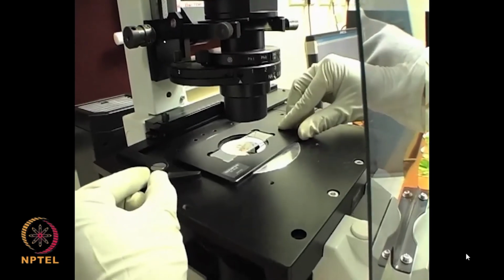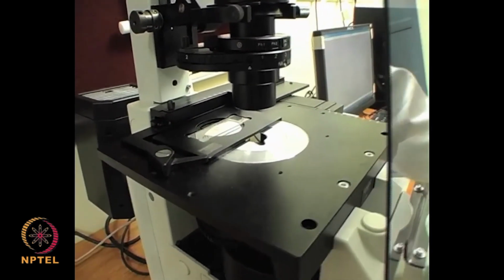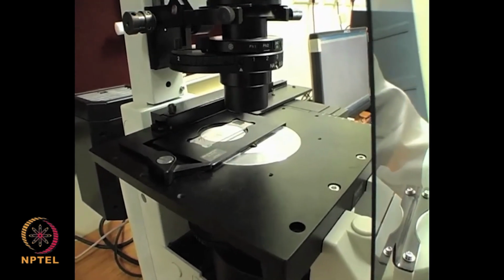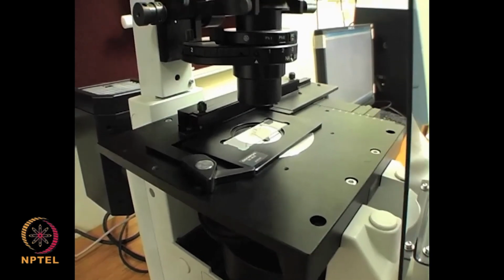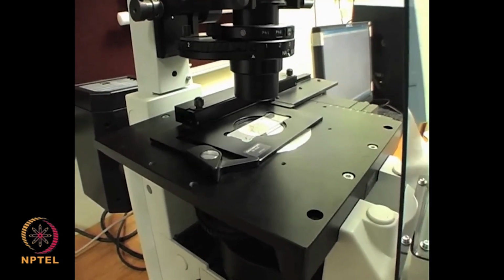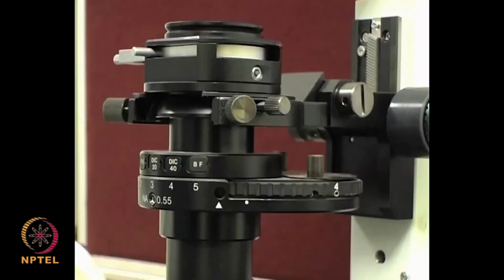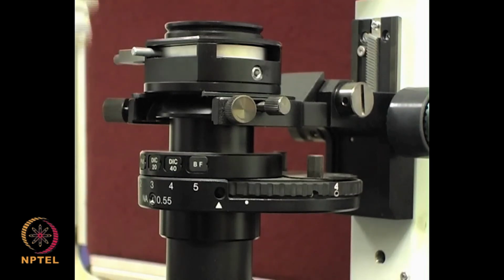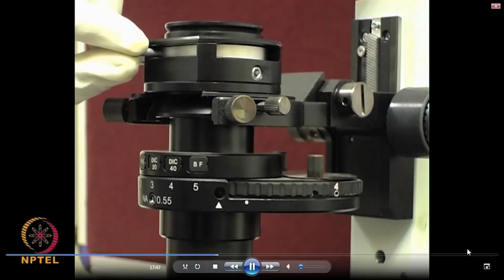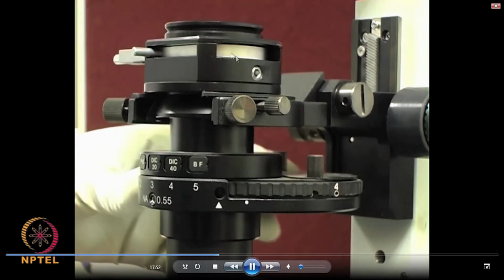Now you can see that the specimen is kept on the stage and it is being brought to the optical axis. As I told in the last class, we have to choose an appropriate aperture. Right now we do not require a polarizer, so it is in the bright field mode.